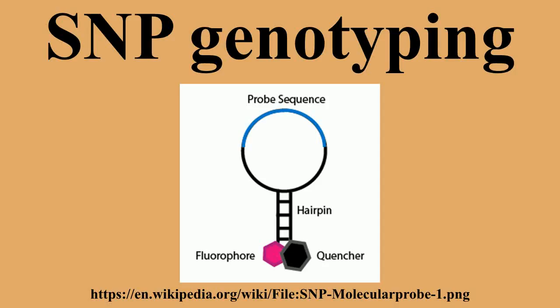Illumina Incorporated's Infinium assay is an example of a whole genome genotyping pipeline that is based on the primer extension method. In the Infinium assay, over 100,000 SNPs can be genotyped. The assay uses hapten-labeled nucleotides in a primer extension reaction. The hapten label is recognized by antibodies, which in turn are coupled to a detectable signal.